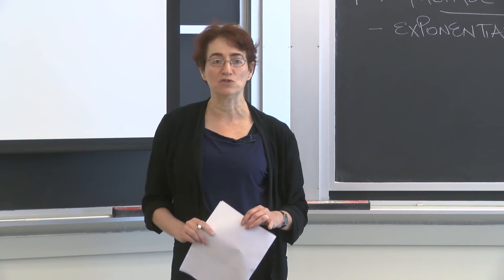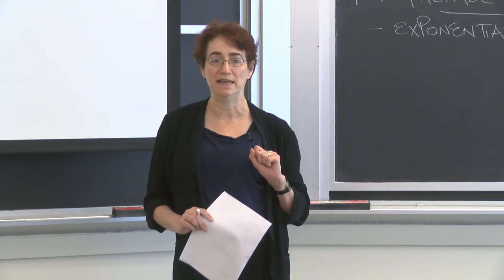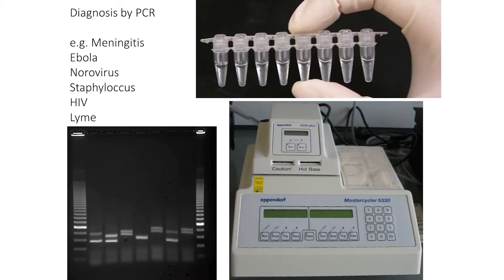With PCR, you can start with one molecule of DNA and use it to do all sorts of things, including, if you look on this slide, diagnosing disease. You can get a very tiny amount of cells from the patient, extract the DNA really quickly, and do a PCR reaction to figure out if any one of a number of different viruses or pathogens is present in the patient.